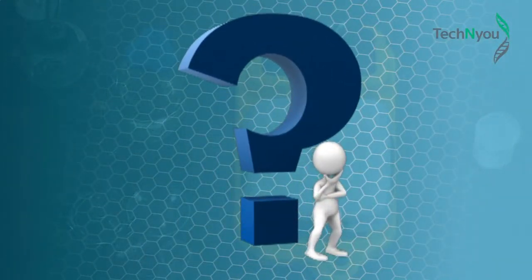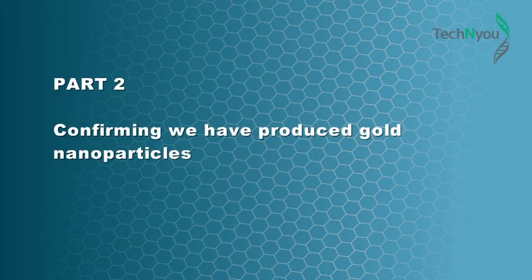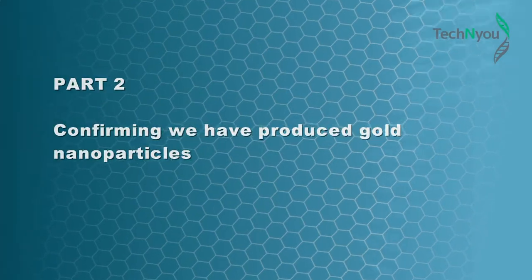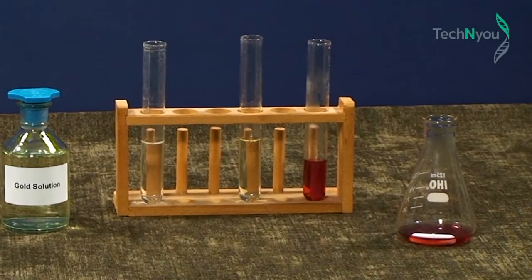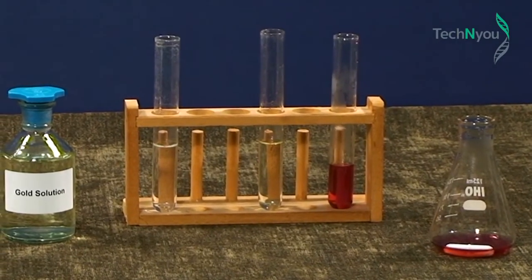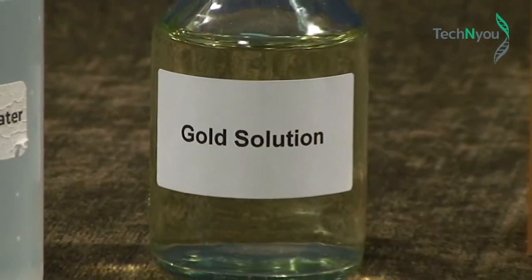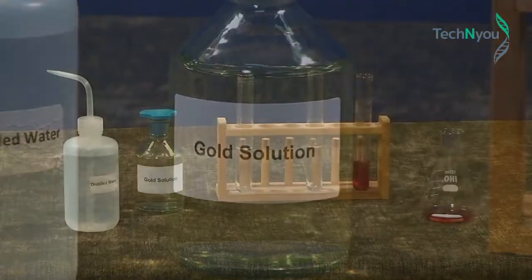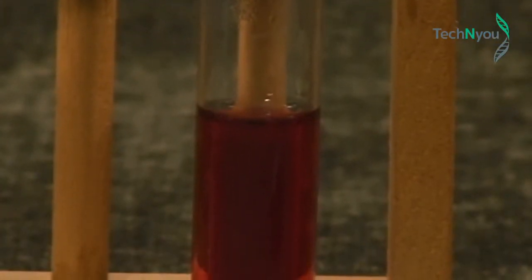How do we know the nanoparticles are present? Let's look at the prepared nano-gold solution. First, remove the red solution from the stirrer. Allow it to cool, and then transfer some of this solution into a test tube. Pour distilled water and gold chloride solution into 2 other test tubes. So, our solutions are distilled water on the left, gold solution, our original solution, in the middle, and nanoparticles of gold on the right.